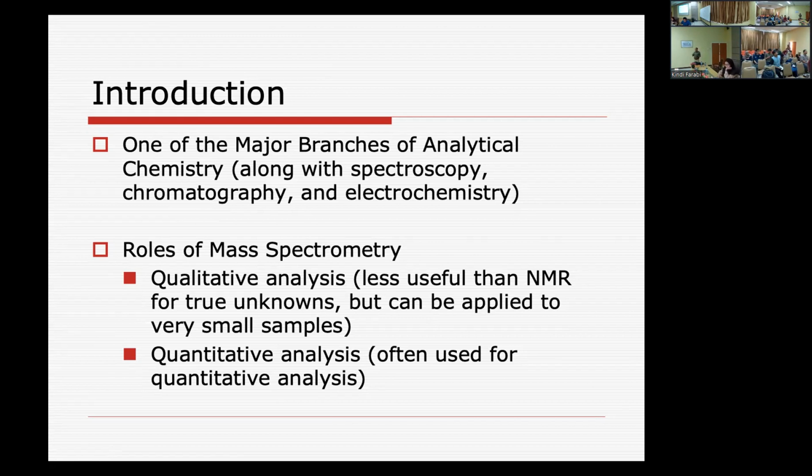Karena dengan pola fragmentasi itu kita bisa mengetahui suatu senyawa utamanya. Namun untuk senyawa yang belum diketahui, atau yang kita sebut dengan novel compound atau new compound, ini kurang tepat karena pola fragmentasinya belum kita temukan. Tapi kalau untuk senyawa yang telah ditemukan, itu bisa dengan tepat.